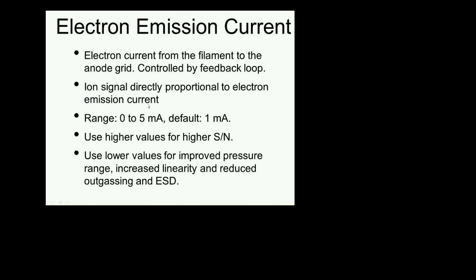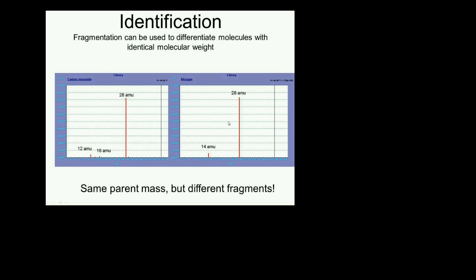So we leave fragments. I'm sure you're going to have questions about fragmentation, but I literally look at fragmentation as your friend. Of course, the ratio between the parent peak and the individual peaks is going to change depending on the electron energy. All the spectral libraries use 70 electron volt energies.